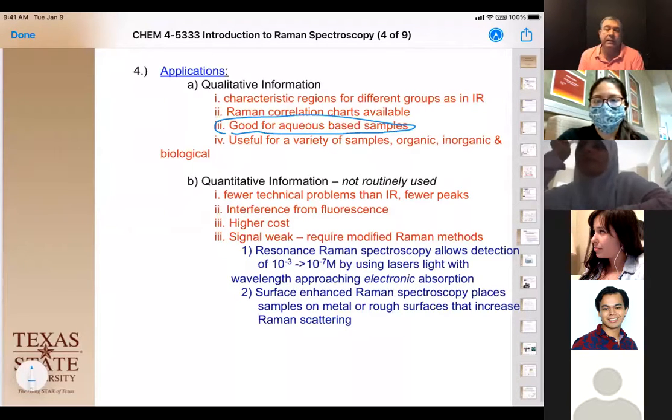The only reason that it's a little more expensive for quantitative information is the fact that you're using a laser system. And lasers have actually come down in price so that they're getting pretty reasonable. A handheld version you stick in a bag of wheat costs about $3,000 now. Okay.